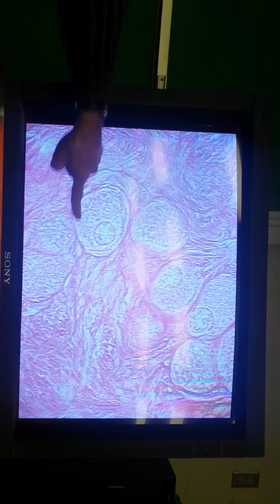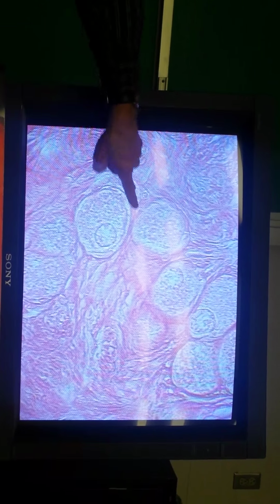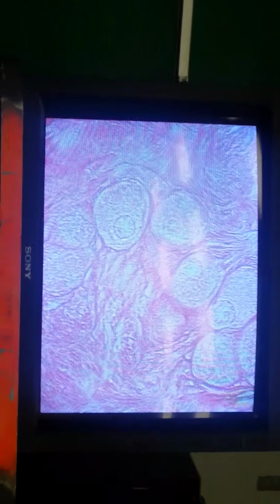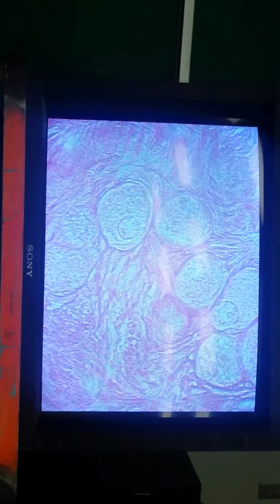We've got a primary oocyte surrounded by a squamous epithelium of follicular cells. Primordial follicles, you'll have more of those than anything else. Okay? Let's see up here. What is this then? This is a primary follicle.